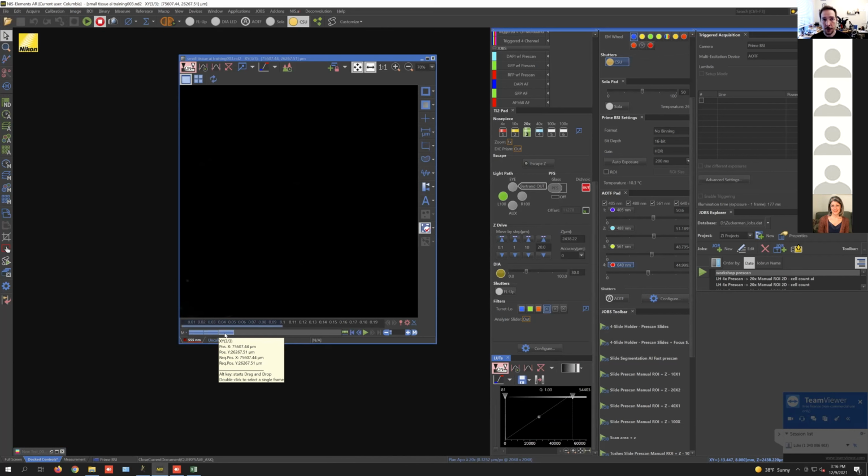And I would try and capture data that encompasses the full range of image data you would expect, like areas where you have lots of axons and dendrites, areas where there's some bubbles and things like that, so that you can really train it to ignore those things while focusing in on cells.